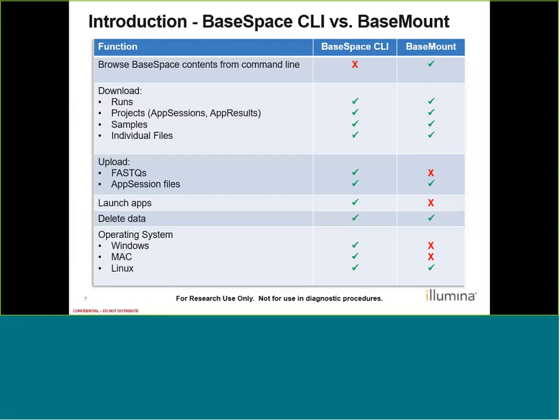With both CLI and BaseMount, we can download BaseSpace entities. This includes downloading full runs and projects, downloading a part of a project like a specific app session, or downloading all files associated with a sample or just an individual file like a FASTQ file or a BAM file. CLI grants us the ability to bulk upload FASTQ files and app session files — these are files like manifest or targeted BED files required for particular apps like targeted resequencing. BaseMount does not allow uploading FASTQ files, but we are able to upload app session files. CLI allows us to launch apps while BaseMount does not. Additionally, we can delete data with both tools. And lastly, CLI can be used with most operating systems while BaseMount can only be used with Linux.